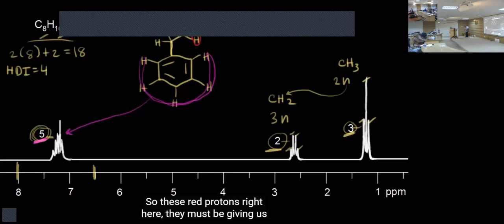And when you see this multiplet, so these are all multiplets. Looking at the integration, you know there are 5 protons, and the value lies in the aromatic region, right? Between 6 to 8, it's aromatic. So all these protons lie in the aromatic region, and there are only 5 protons. So you expect, okay, they are all together, and there is no substituent in between.